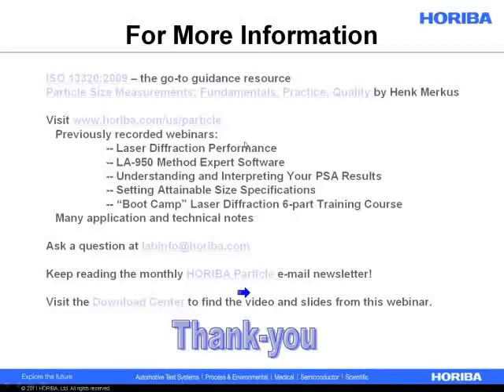Pascal asks a very interesting question. In the nanometer range, do you get better resolution and/or accuracy for titanium dioxide than other materials with lower refractive indices? I say it's an interesting question because it's probably a little difficult to answer in the scope of this presentation. It's a better question to answer through email where we can give drawings and diagrams and offer a more complete explanation. But what I will say is that titanium dioxide, especially if you try and measure it as a dry powder, has always been one of the most difficult applications.